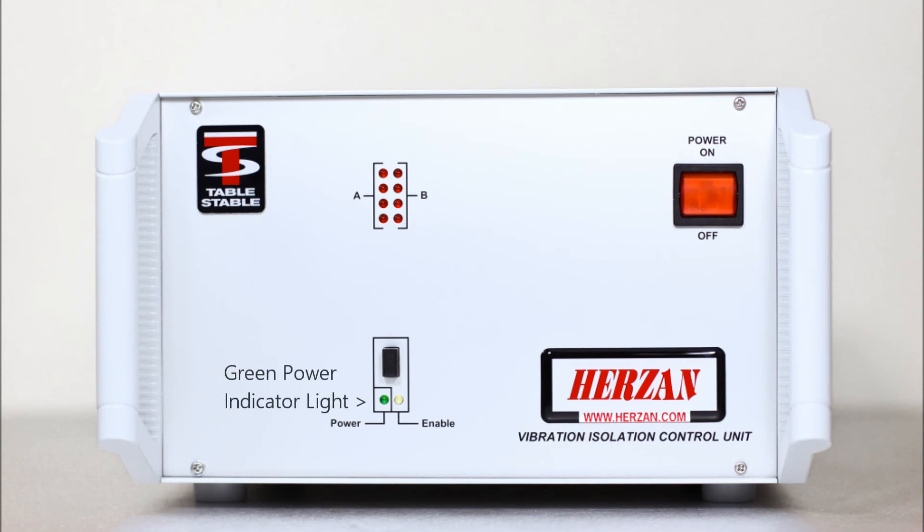The green power indicator light will now turn on and the red module indicator lights will begin to flicker. These lights demonstrate the impact of vibrations present on the AVI sensors, which will go away once the active isolation component of the AVI platform has been enabled.